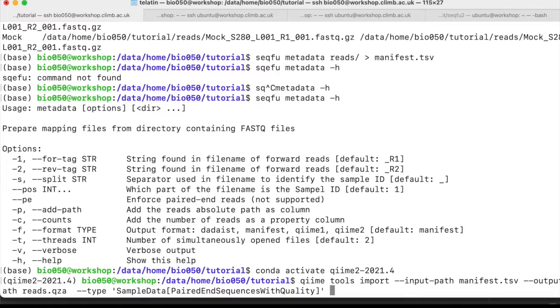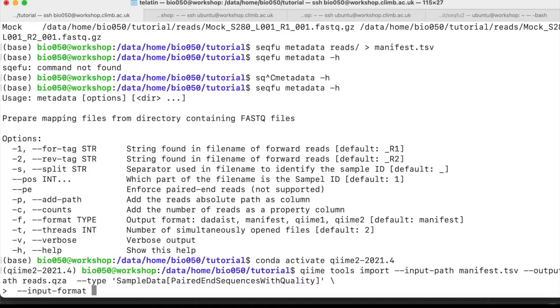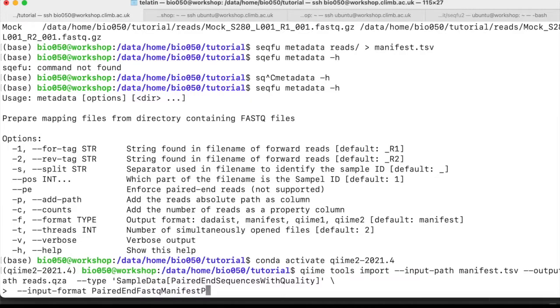What we are changing now is the way we are feeding the information to QIIME. So in this case, it will be, again, for clarity, I go to a new line. --input-format PairedEndFastqManifestPhred33V2. So this is the quality score encoding.